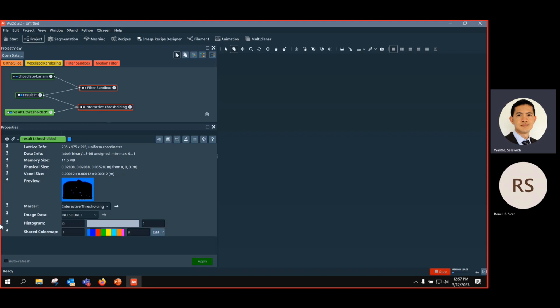It's going to be better tomorrow with the watershed segmentation for sure, and we also have machine learning to detect different patterns of the object. So with this, it's just a very global one-material segmentation. Everything that is in this blue mask is going to be considered as material one. So we have only one material, actually two: a background at 0 and material 1.